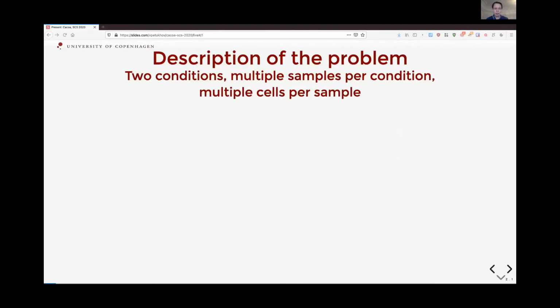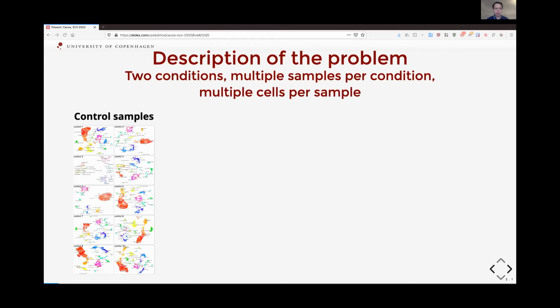The point is that during the recent years, single-cell RNA-seq became higher and higher throughput, and cheaper and cheaper. So now we can do lots of cells, and they don't have to be from the same sample. We can profile multiple samples at the same time. And that allows us to do case control analysis, case control experiments.